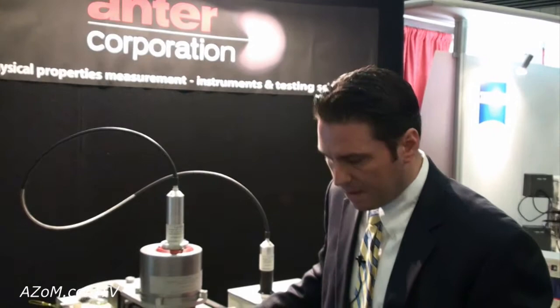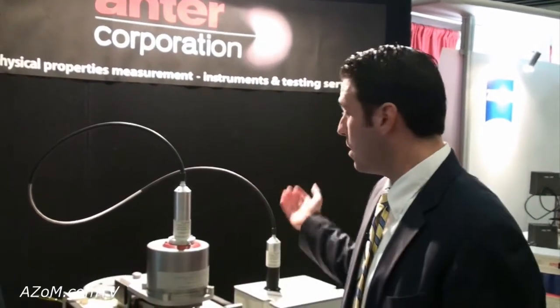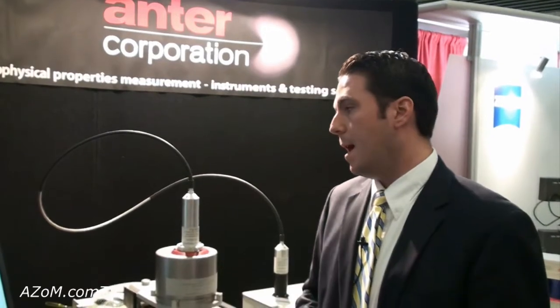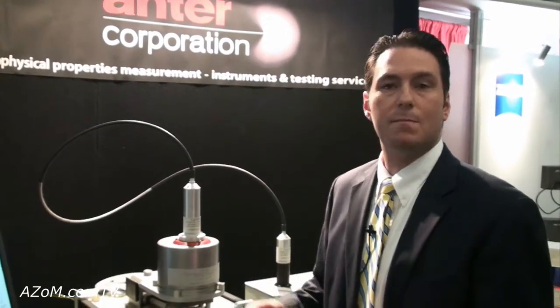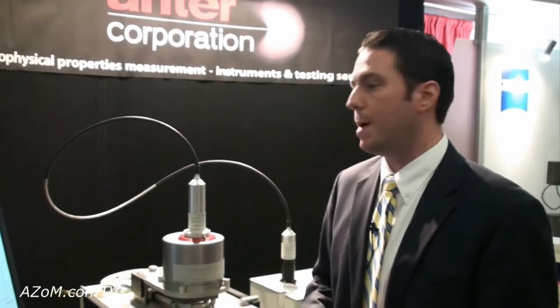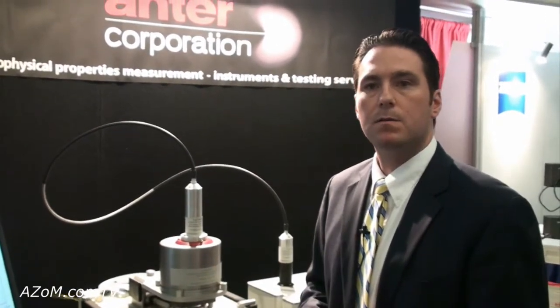And how long does it take to take a measurement? Once it gets to temp, it's a very quick test because it is a transient test. You're pulsing it with laser energy and measuring the back time curve. Typically, if you're doing a room temp test, you can get six samples done in a matter of a half hour to 40 minutes.